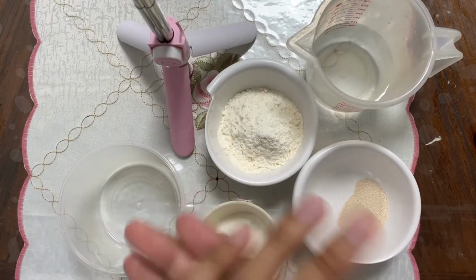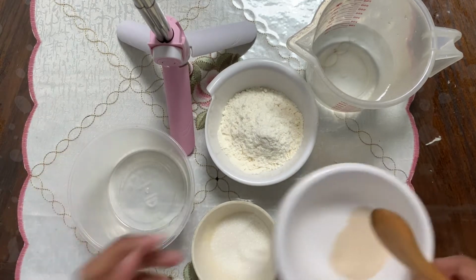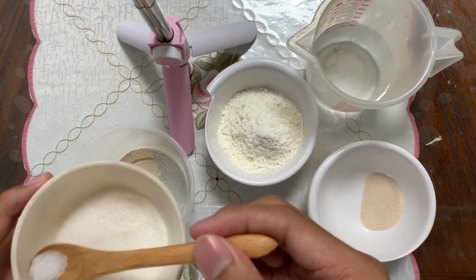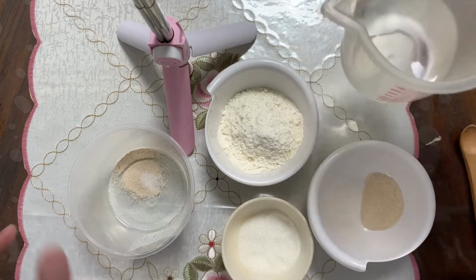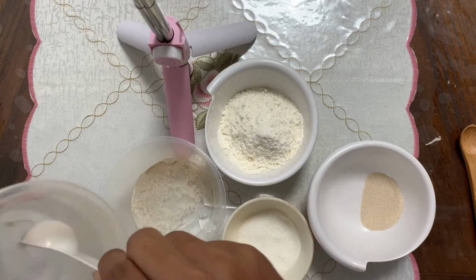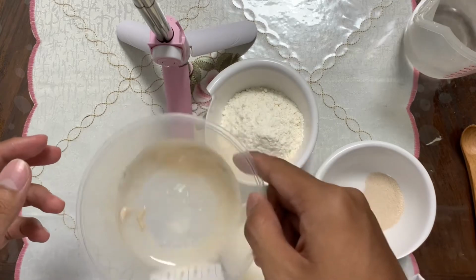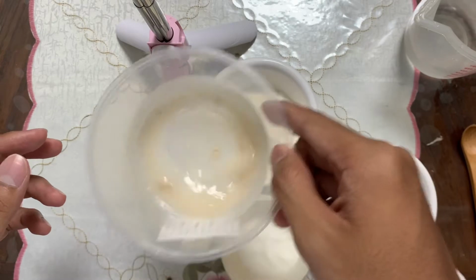So now we will do the cold water dough. First add 1 teaspoon of yeast, 1/4 sugar, and then 30 milliliters of cold water. And then stir it and check for any bubble forming.